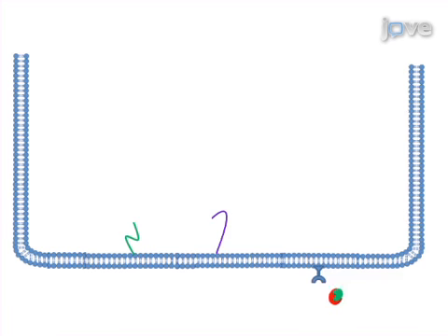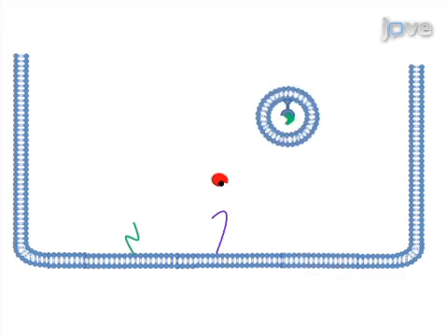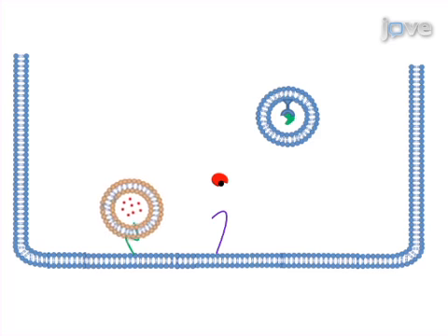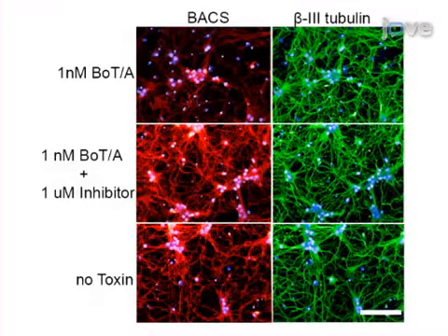This assay identifies molecules that can inhibit botulinum toxin activity and thus prevent SNAP25 cleavage in the presence of botulinum toxin, and so restore neurotransmitter release in the neuromuscular junction. A high-content imaging assay performed with mouse motor neurons is used to demonstrate the preservation of SNAP25, resulting in the identification of small molecules that can inhibit the metalloprotease activity of botulinum neurotoxin A.